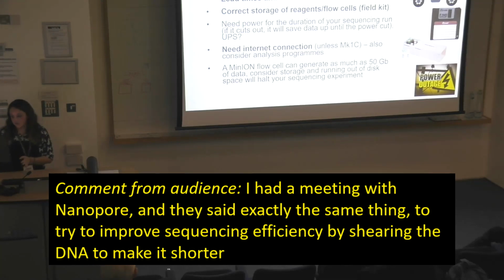And if you run out of storage space on your computer when you're running it, it will halt the experiment as and when you run out. It's the same if the power interrupts as well. It will halt it when the power interrupts. So it's really important to have power, internet, and also enough space.